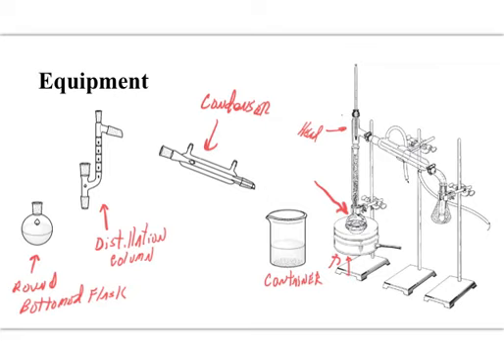We have to hook up the condenser where the water comes in at the bottom and goes out at the top. Right? That will fill up this jacketed condenser with water and allow it to cool. We may or may not have an arm attached to it. We may distill right into the open container. Again, I have to see what they leave for us, and then this will be our container that we collect the material in.